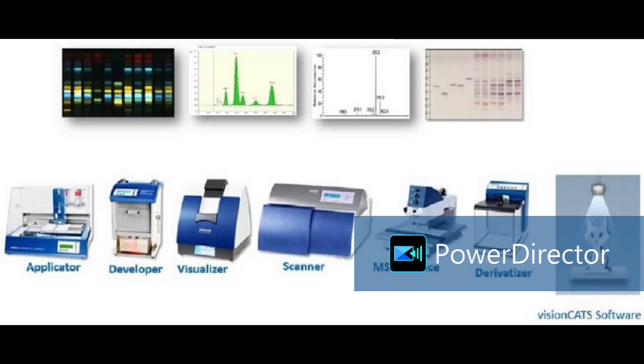We can scan the plate, we will get area for quantification, 3D chromatograms, then peak response, then absorption spectra we will generate from 190 nanometer to 400. Absorption spectra is a very unique property of any compound. For identification of unknown, it is a very important feature property.